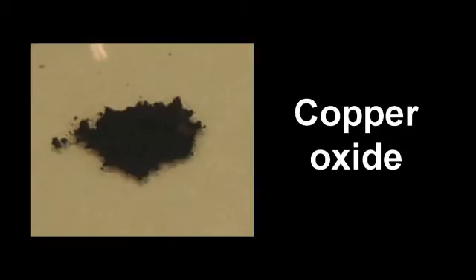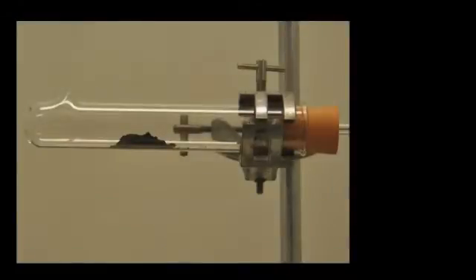Copper oxide is a black powdery solid. We place a small amount of copper oxide in a boiling tube which has a hole in the bottom. Methane is passed through a tube which passes through a bung.